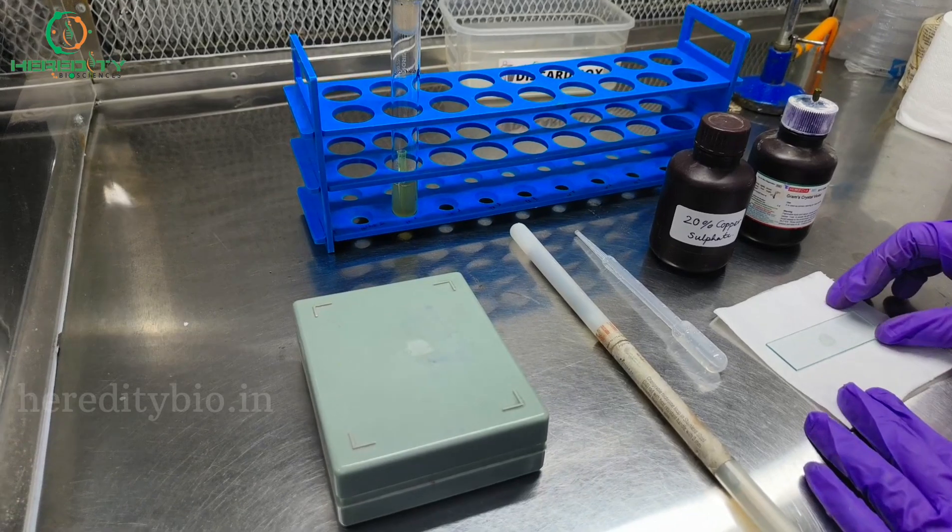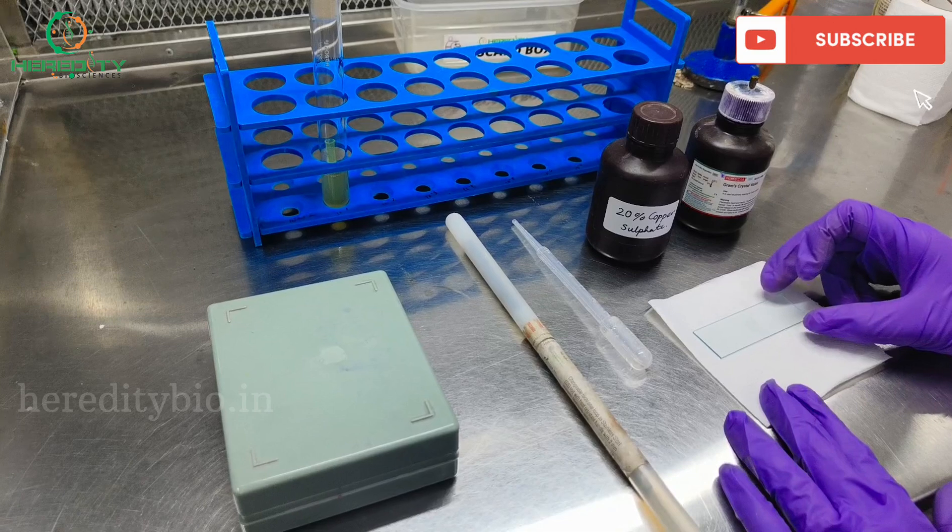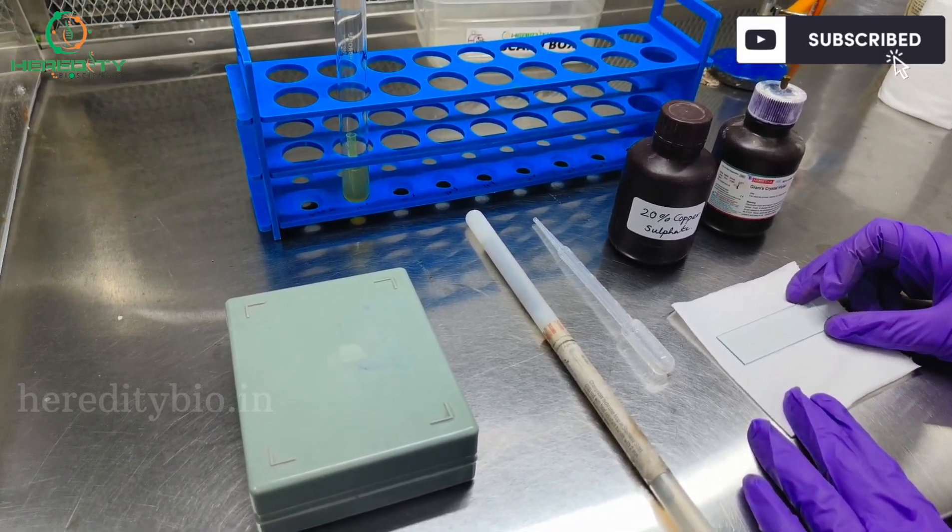First, we will prepare a bacteria smear. I have already prepared a smear but do not heat fix it. Heat will destroy the capsule so you cannot visualize it.